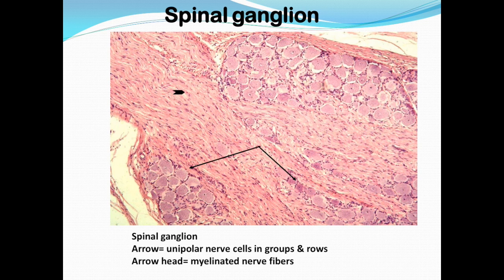If you are asked, mention one or two features that help the diagnosis: the arrangement, first of all, and number two, the cells are variable in size. They are very evident in the picture. Also, if you are asked for three reasons, you can add that the cells are more or less rounded, meaning that they are unipolar cells.